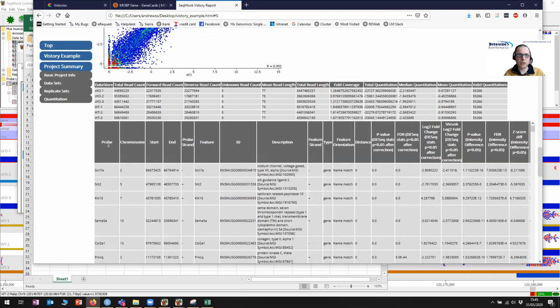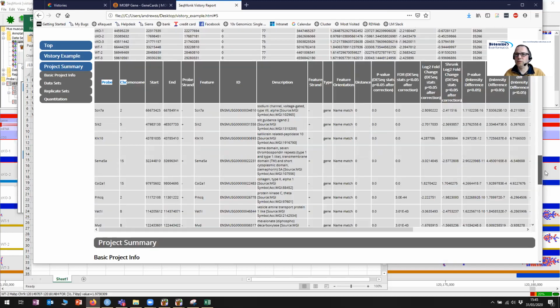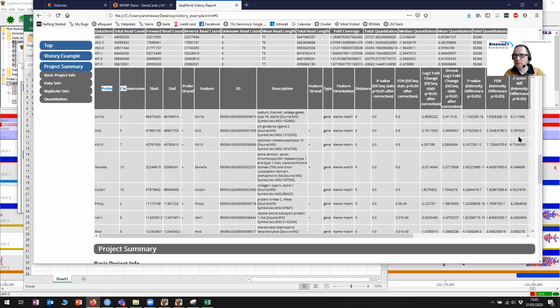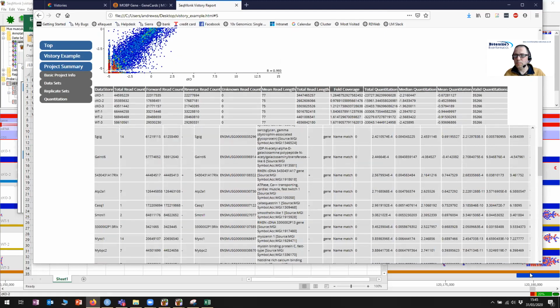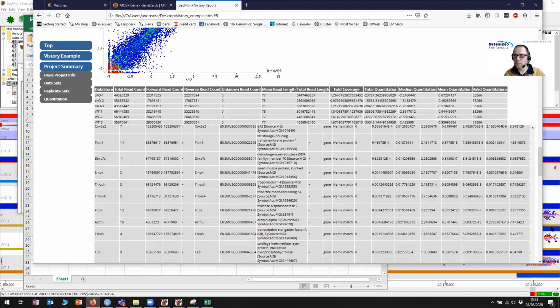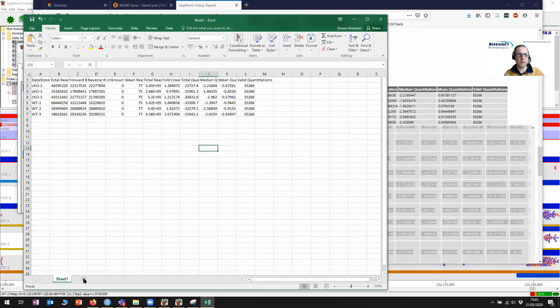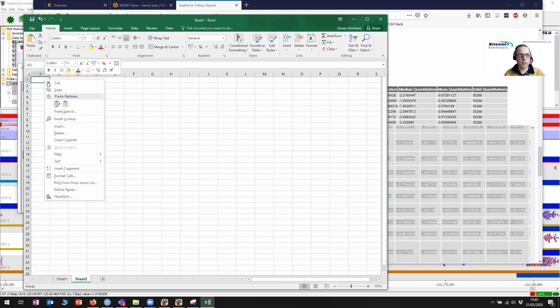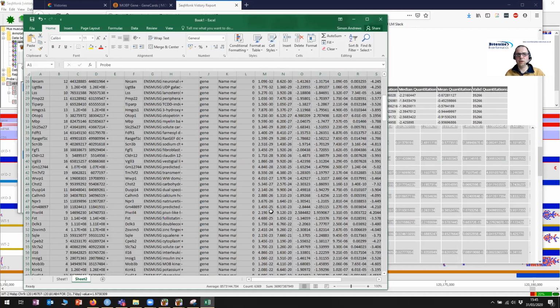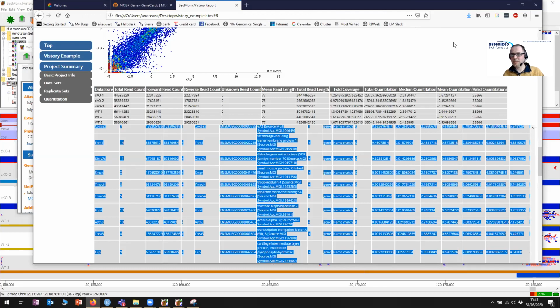If you select the top of it and then scroll to the bottom, and shift and click on the bottom of it, that should select the whole lot, and then that should paste into there. So that will also go out, so you can get that from there as well. Okay, nice. Thanks.